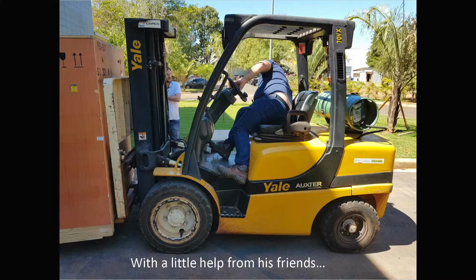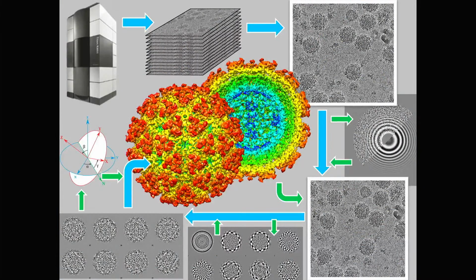Some strong friends. And now things like Mayaro virus structure determination is something that we have sharpened our teeth on, and that works fantastic. So all the procedures here, film, CTF finding, eigenvector analysis to classify the views, all these things. I shouldn't use the mouse, but should use this one here. So here the eigenvector analysis of these centered particles after CTF correction, particle picking. So you refine, and the structure of this thing is below 4 angstroms actually.